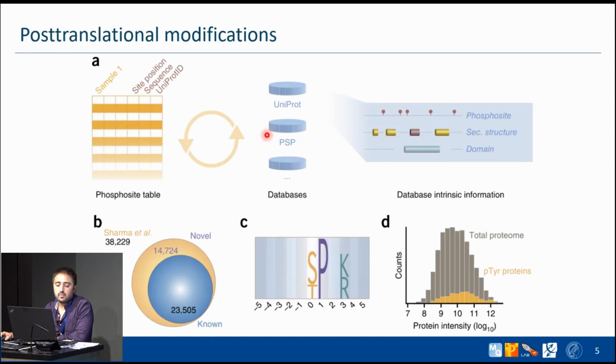You can also use Venn diagram visualization of your data. Exactly, just by clicking a few buttons. And this is particularly important to either compare two samples or see how a specific subset of your phosphorylation sites, let's say your peptides, actually compares in size to the total population.